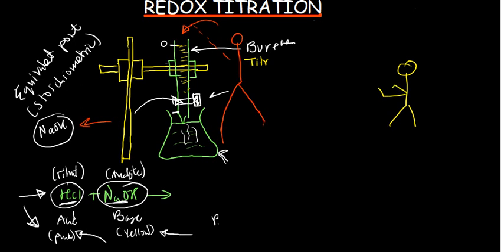You are going to get a test tube containing that substance just at a distance from you, and then start fanning it, using your other hand to push air towards your nose. So how do you smell things in a lab? You fan the smell towards your nose at a distance. Don't bring it near you, otherwise that's deadly, it's dangerous.